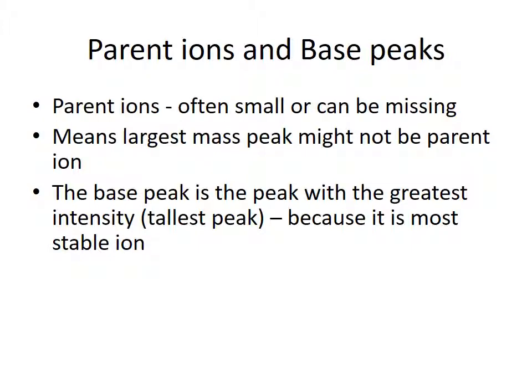Be aware that the molecular ions can often be missing. The largest mass peak may not be the parent ion. I'm not going to do that to you. At this point in time, that's not my goal. I'm going to teach you the basics of this.